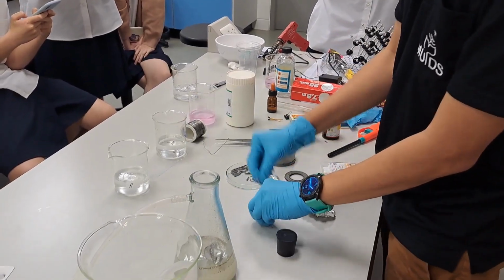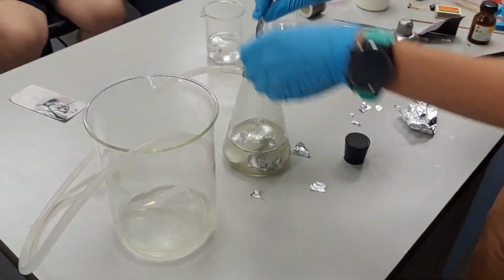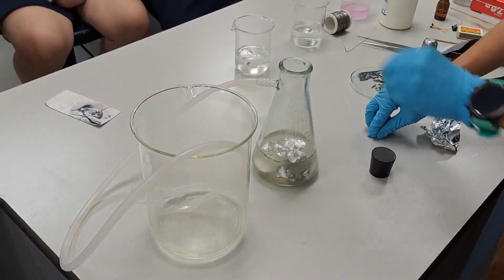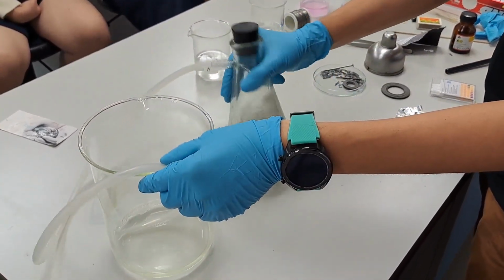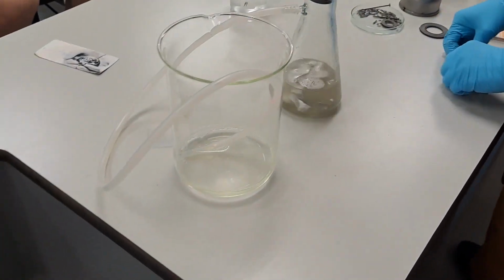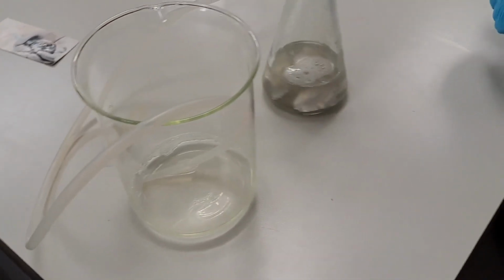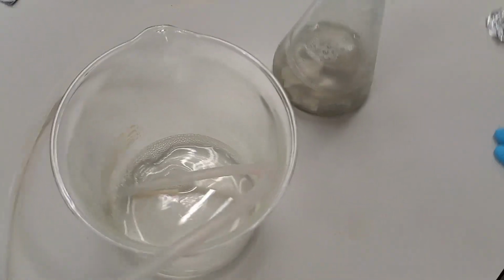Alright, go. This may take time, that's why I talk about chlorine first. On group 7, you will have fluorine as the first element, right? Okay, let's see if they produce anything. I will add more because it heats up a little bit. Okay, and we wait, right?